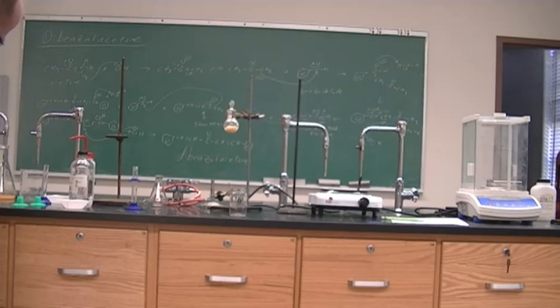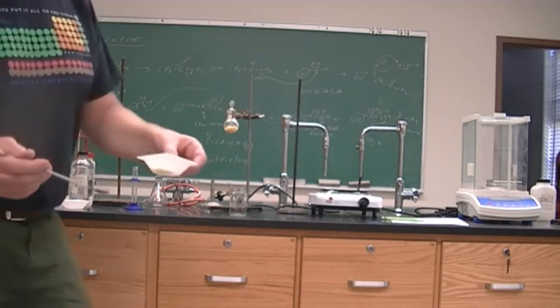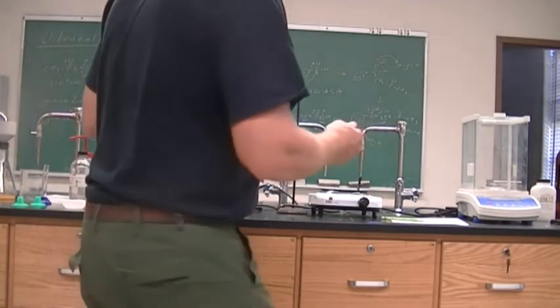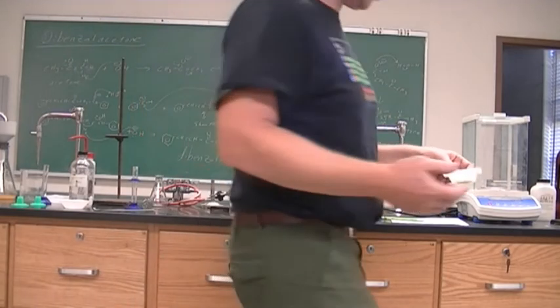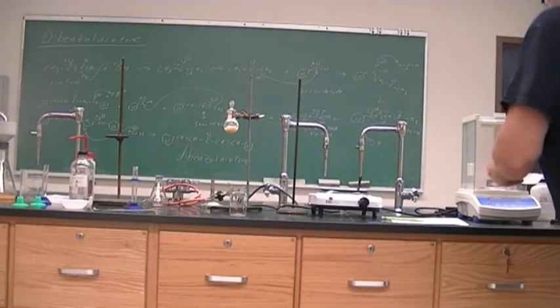So the melting point of one cis, one trans is 60. There was no melting at 60. And the melting point for both trans is 110, and we had 106.5. And it could be off a little bit because we didn't wait for it to dry. Many times we would let it sit a week and make sure it was completely dry before we took the melting point.